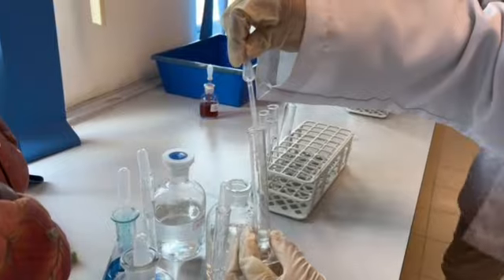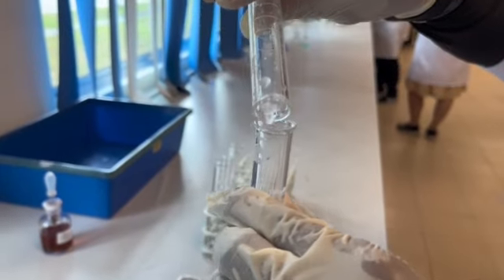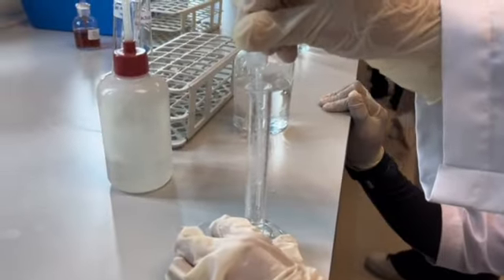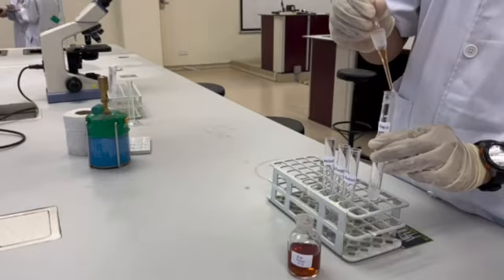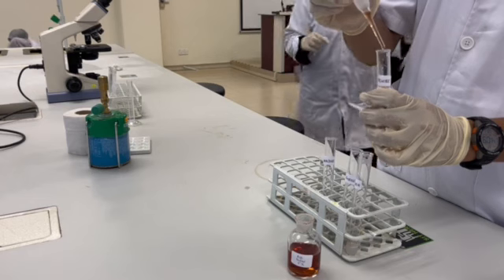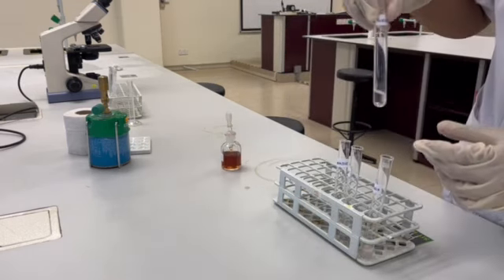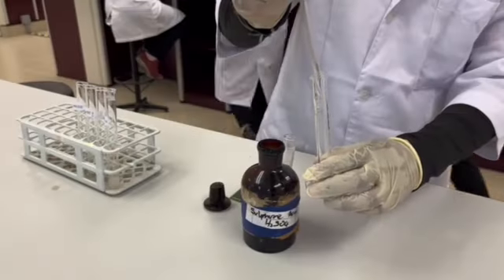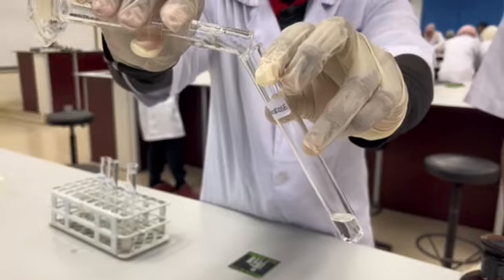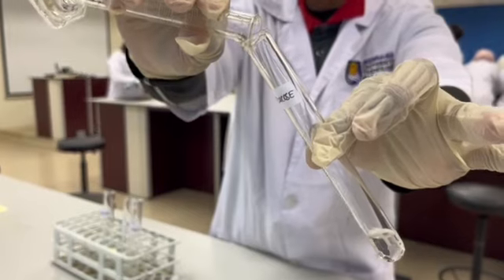Measure 2 ml each of sucrose 2%, glucose 2%, maltose 2%, and starch 5% into 4 different test tubes. Add 5 drops of alpha-naphthol solution 5%. Mix by gently shaking. Slowly place 1 ml concentrated sulfuric acid into each of these test tubes. Make sure you do not shake them. Observe the color change and record the result of the experiment.